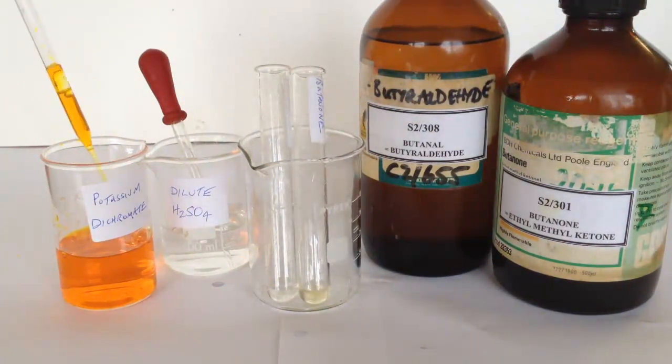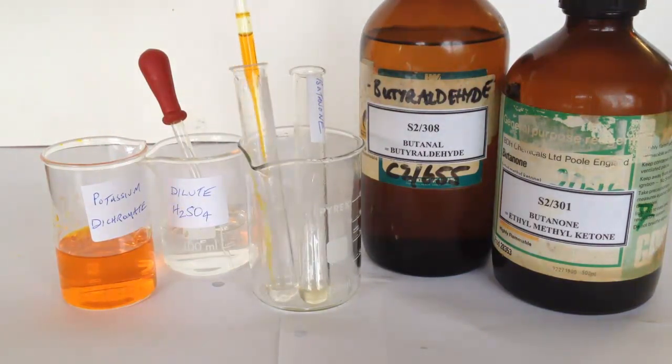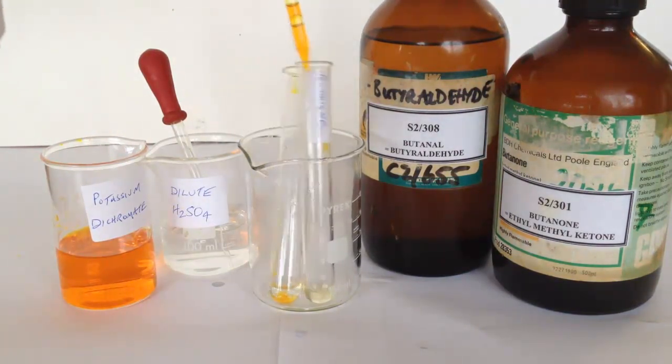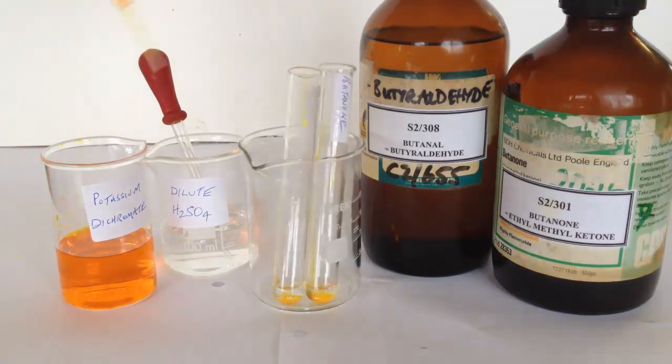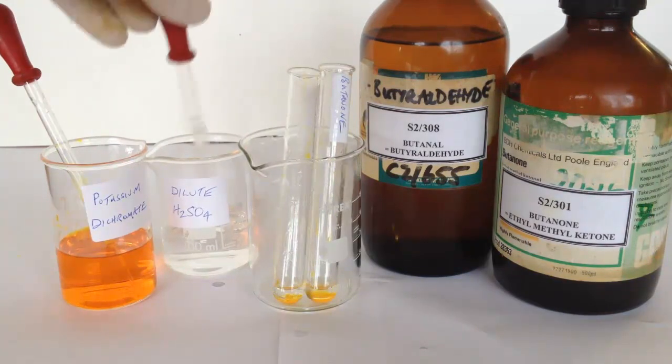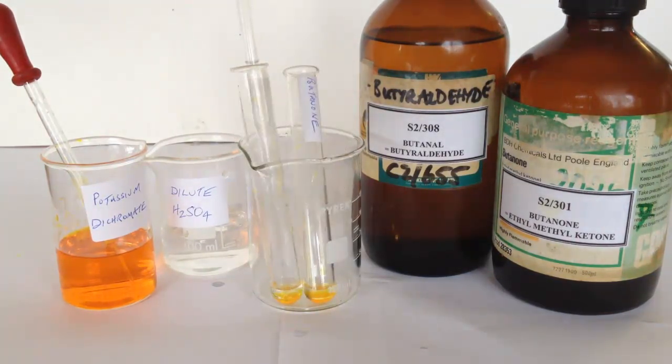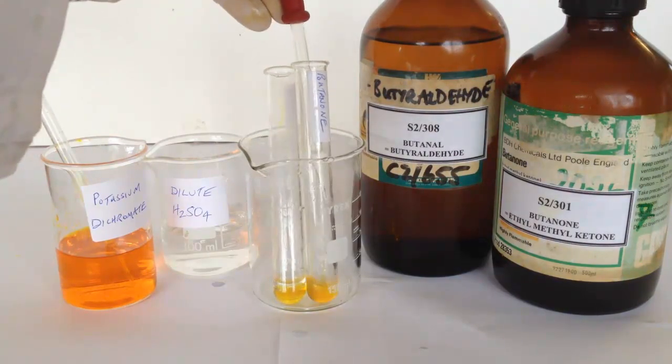I add about one cubic centimetre of an aqueous solution of potassium dichromate to the aldehyde butanal and to the ketone butanone. The acid is used to help the oxidizing agent work, so I add about a cubic centimetre of dilute sulphuric acid to each of the test tubes.